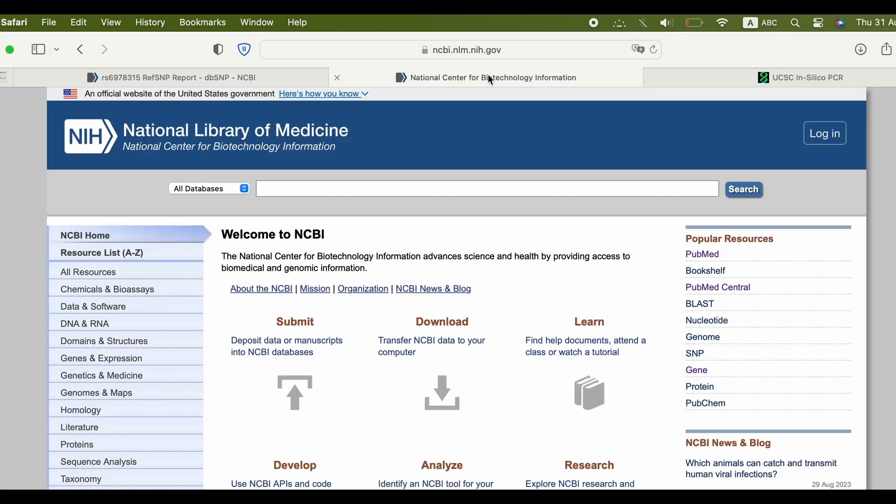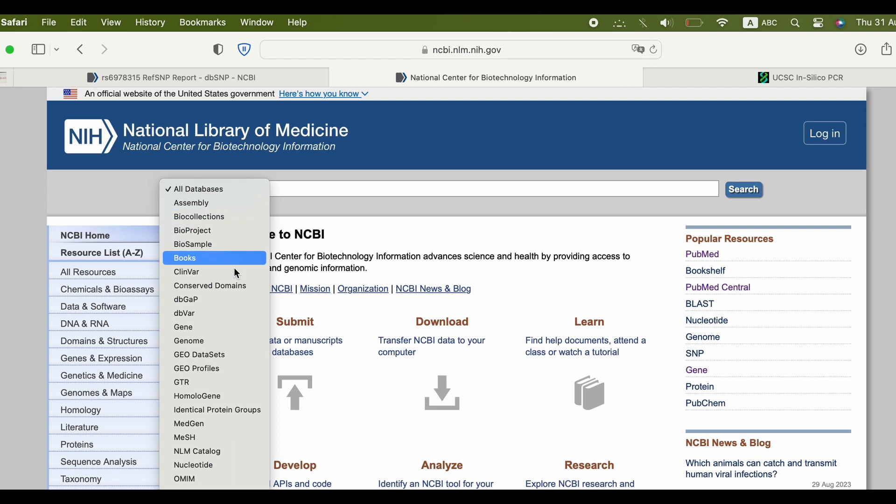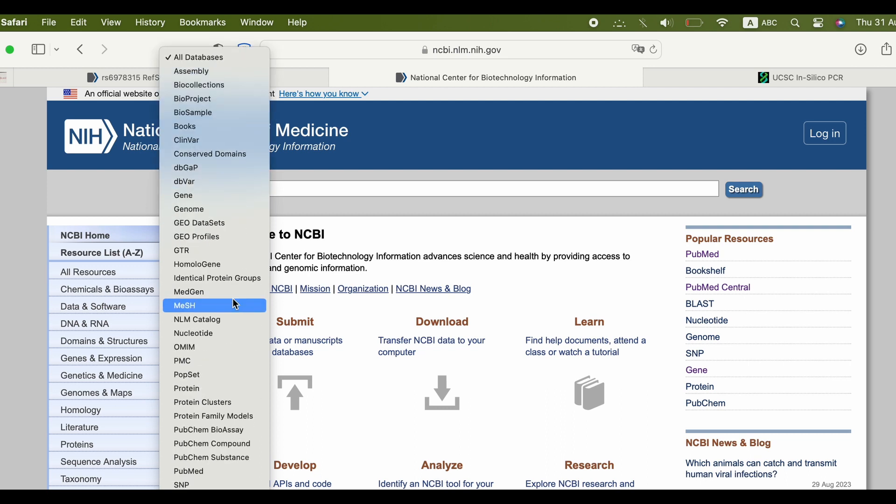In a new tab, now go to NCBI again and select Gene, and insert the name of the gene you want.